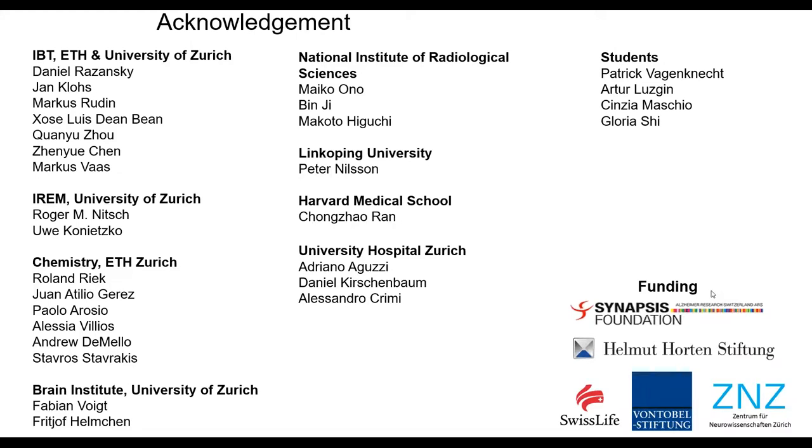Okay, further question. Would you consider OCT, optical coherence tomography, as an alternative way to image these probes? I think that's a very interesting technique, but I have no experience with that. Sorry.